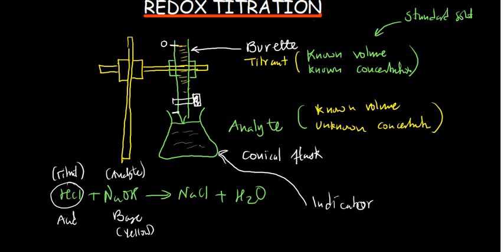But the same indicator in the acid might be pink. When I start adding the hydrochloric acid to the sodium hydroxide, the solution will still be yellow, but I'll reach a certain point when the color starts changing into pink. Immediately it starts changing into pink, I'm going to know that all the sodium hydroxide has reacted.